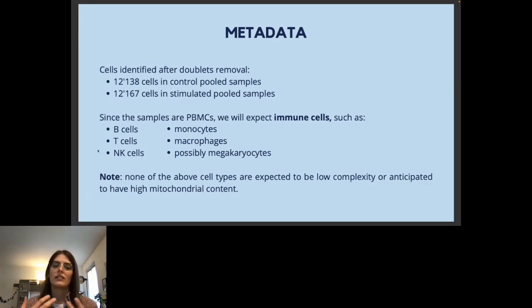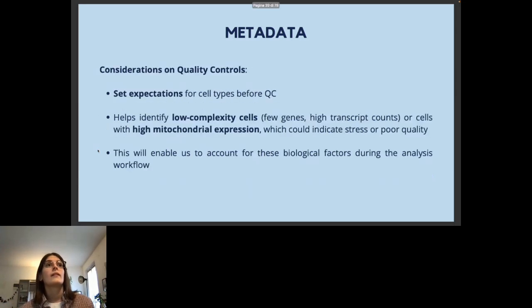Do you expect a great variability or not? Do you expect a low complexity or high complexity transcriptome inside your cells? Again, do you expect to have high mitochondrial transcripts or not? This is very cell type dependent, and based on the cell types you expect to analyze, you set different thresholds for your quality control filters.